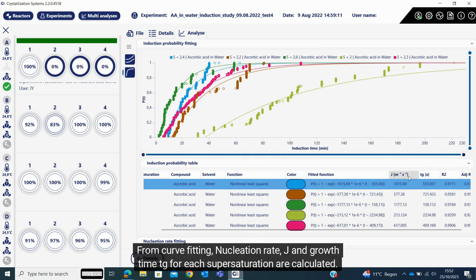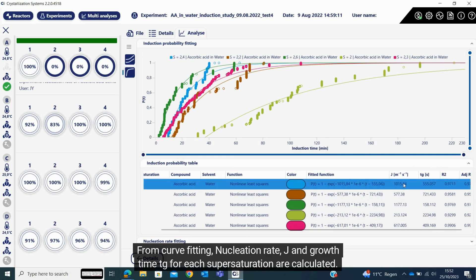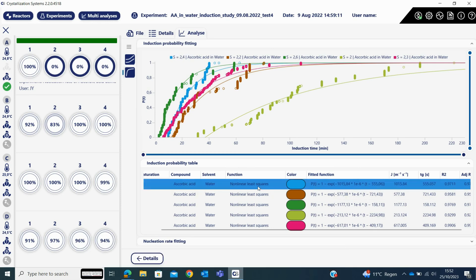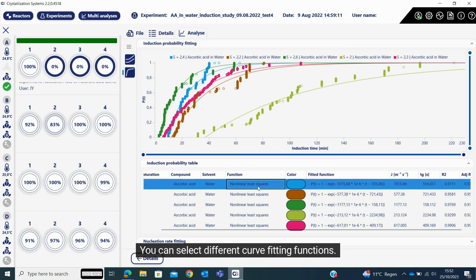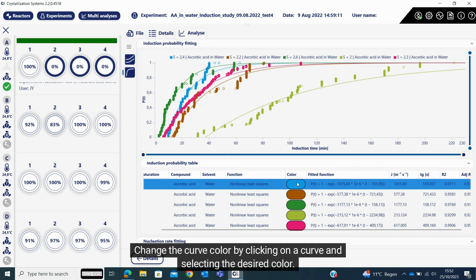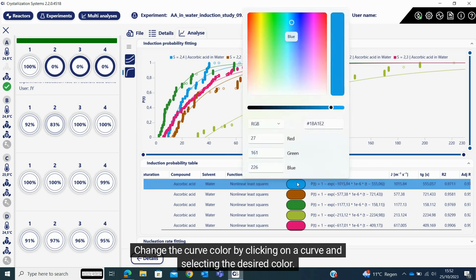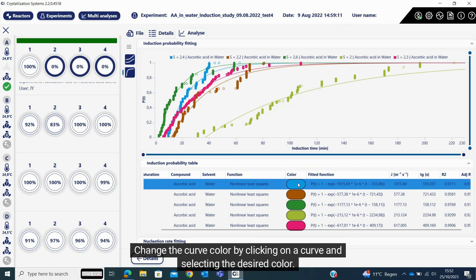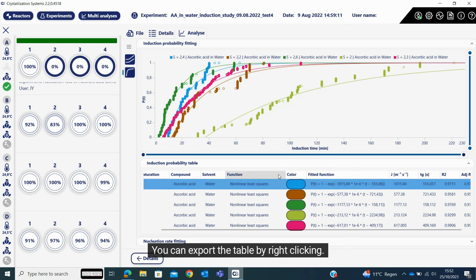You can select different curve fitting functions, change the curve color by clicking on a curve and selecting the desired color. You can export the table by right clicking.